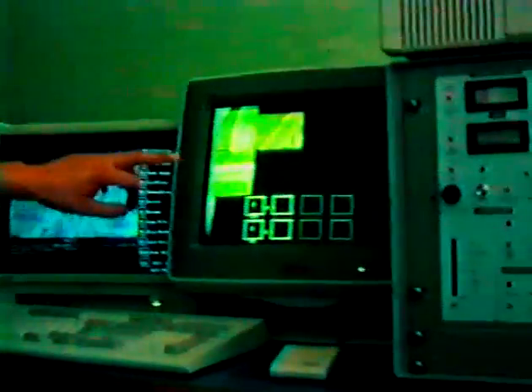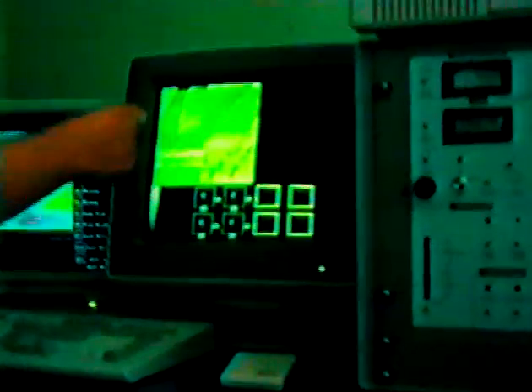These pictures were taken on a graphite surface, and you may see here some steps. We could reach atomic resolution even without isolation from noises and mechanical vibrations.